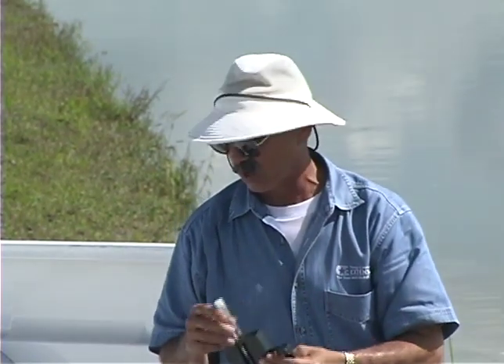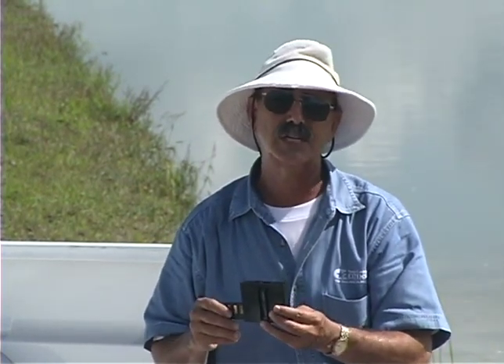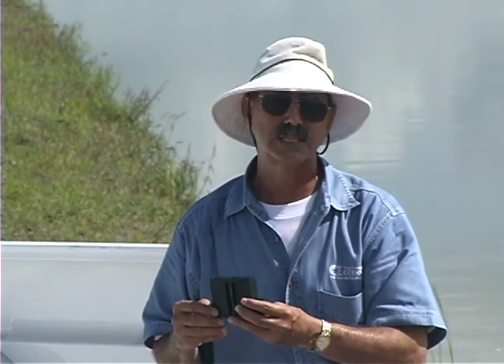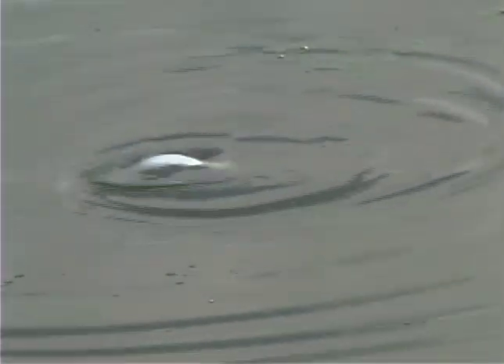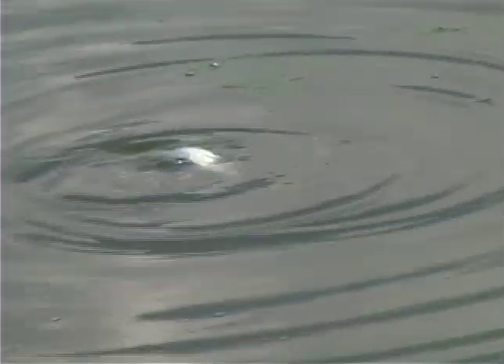Now, under certain water quality conditions, that amount of ammonia can be toxic to fish. We now need to check the water temperature as well as the pH to determine whether or not a toxicity was present and possibly killed these fish.